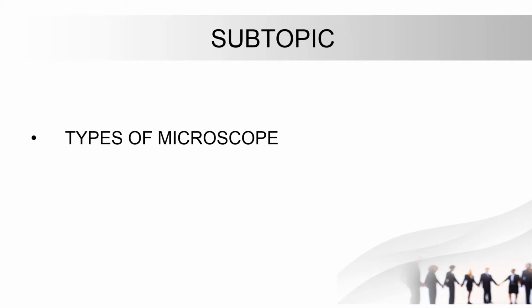As I said earlier on, we have already mentioned the simple microscope and the optical or light microscope. So currently we are dealing with the light microscope, and we've already mentioned the simple light microscope.